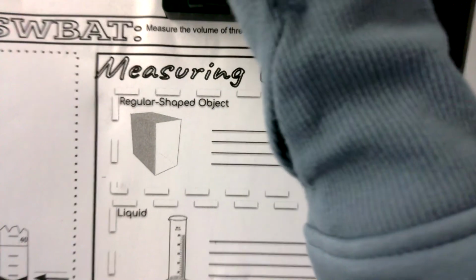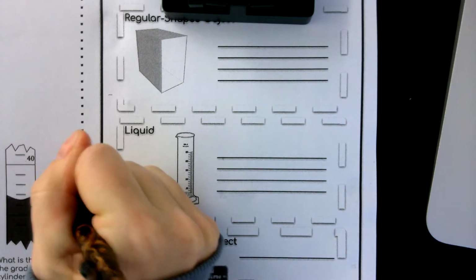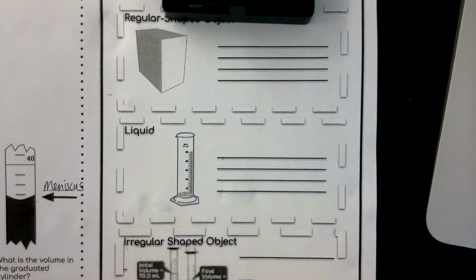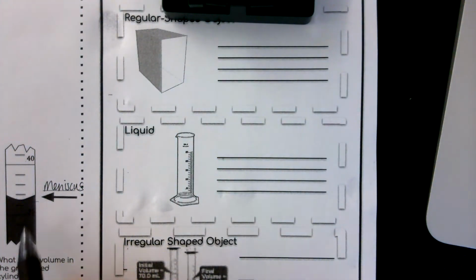I have to change my camera angle depending on if it's sideways or not. So this right here is the meniscus. Okay, so that bottom of that semicircle, that's where you read for the volume. Any questions so far? No? Okay. So then I want you guys to try and read what the volume is in this graduated cylinder. Okay, so there's that question right there.